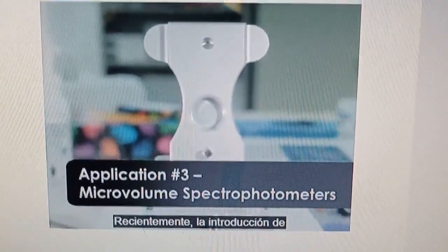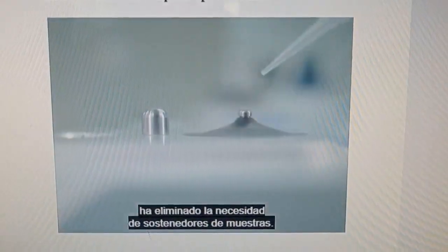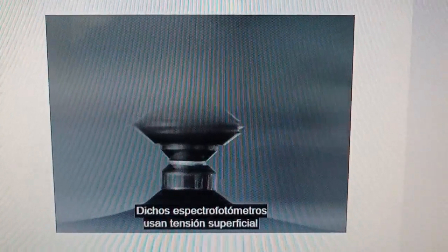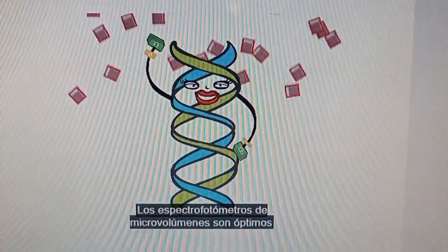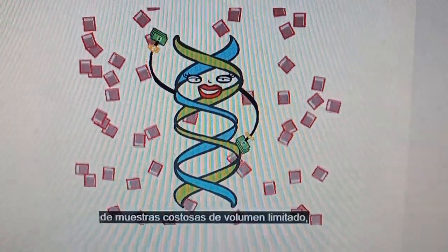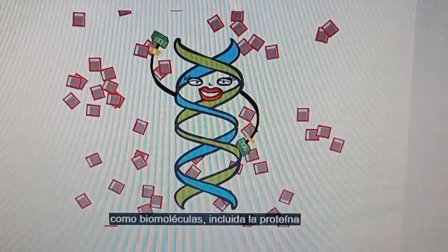Recently, the introduction of microvolume spectrophotometers has eliminated the necessity for sample holders. Such spectrophotometers use surface tension to hold the sample. Microvolume spectrophotometers are optimal for measuring quality and concentration of expensive samples of limited volume, such as biomolecules, including protein and nucleic acids.